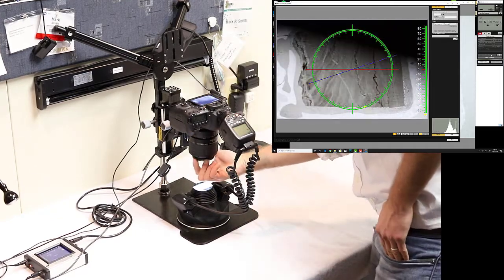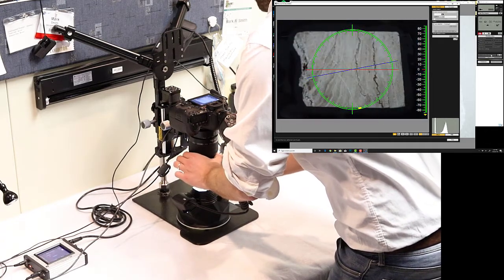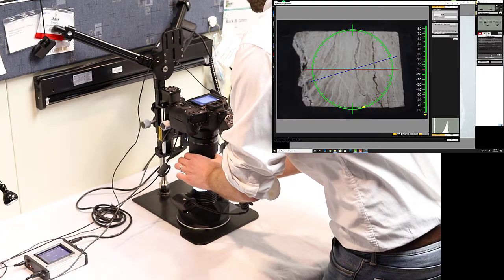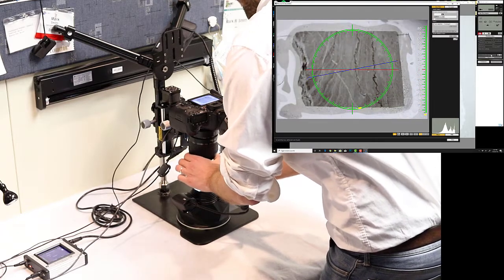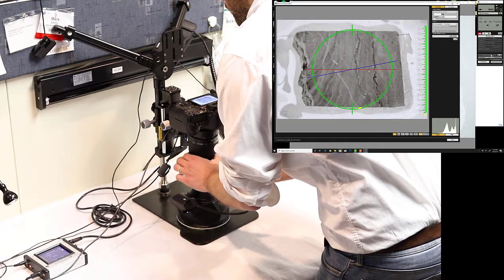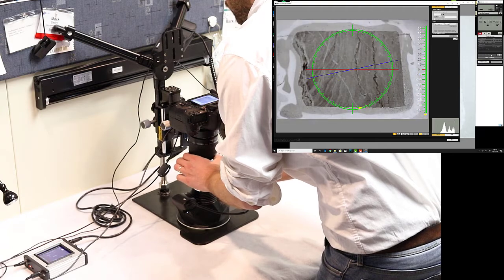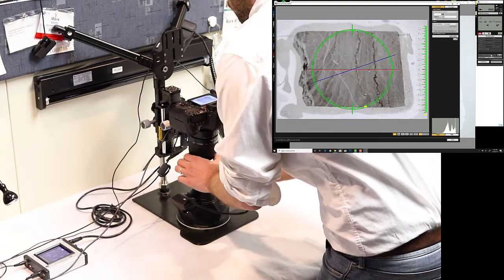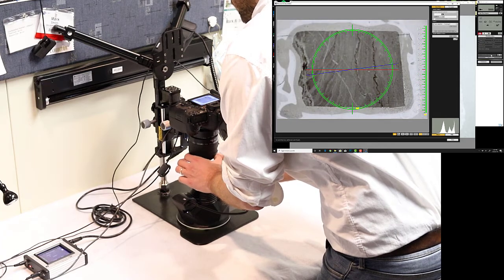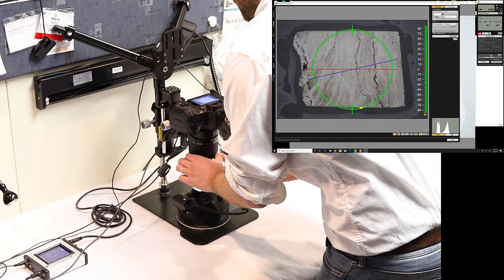It's a 58mm filter, and you'll actually see in the live view what happens as I rotate this. When you take two polarizers and place them at a 90-degree angle to one another, it blocks out all light that's coming into your lens. However, when light passes through a crystalline structure, the light particles get projected into a different direction, so you can still see the light that comes through a crystal lattice.